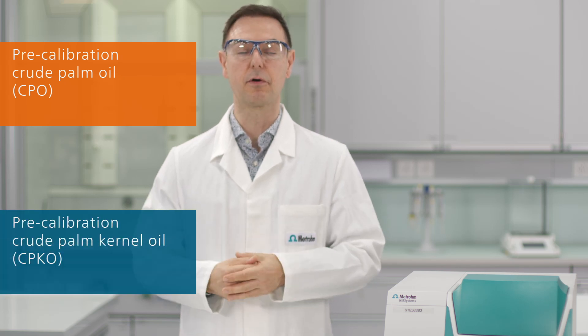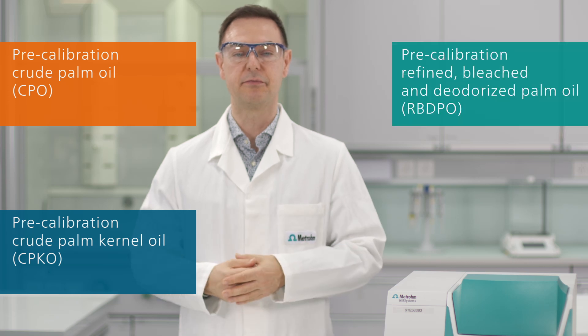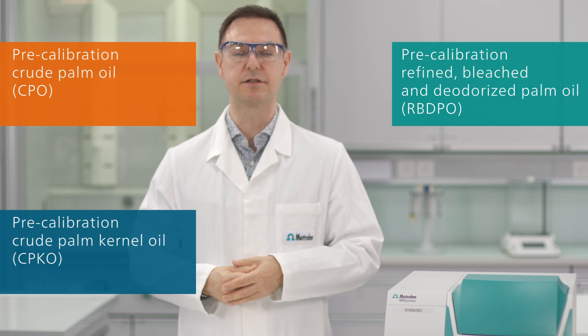Aside from the pre-calibration for crude palm oil, Metrohm also offers ready-to-use pre-calibrations for crude palm kernel oil, as well as refined, bleached, and deodorized palm oil. Measure key quality parameters in palm oil samples with the DS2500 liquid analyzer.